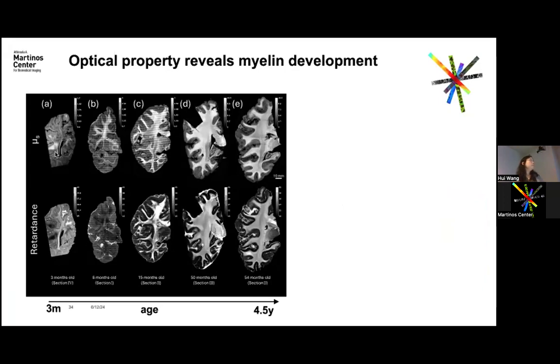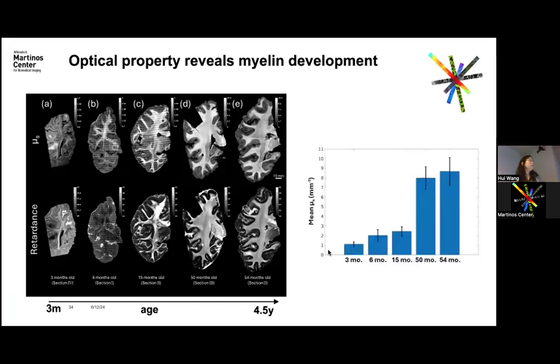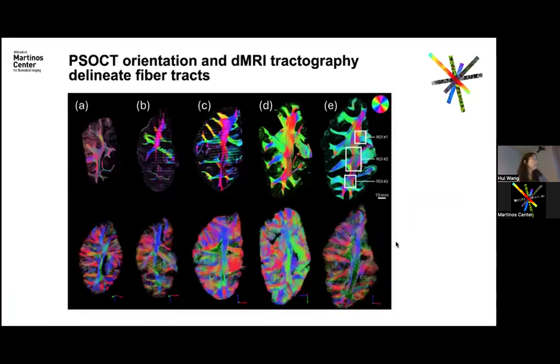You can see nicely across this timeline that the scattering coefficient increases over the 5 years, and there is a big jump after 1 year, to the 4 years.